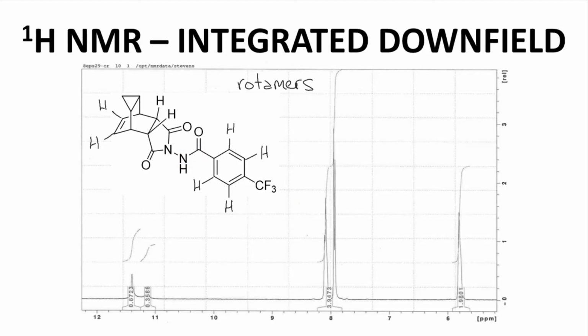So I'm explaining these 2 peaks by saying we have 2 isomers. There is another possibility. Maybe one of these peaks is from the NH of our product, and maybe the other peak is an impurity. That is completely possible. I have 2 reasons I believe these peaks are from 2 conformational isomers.